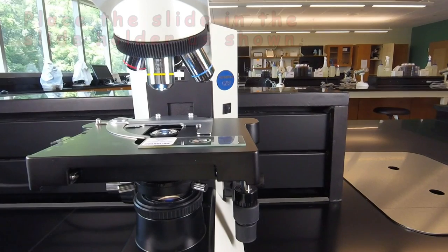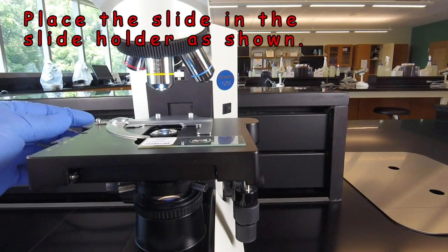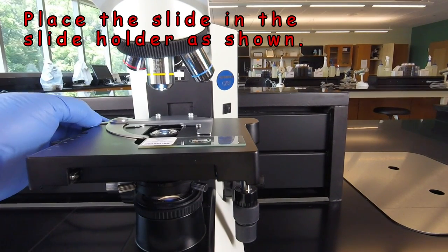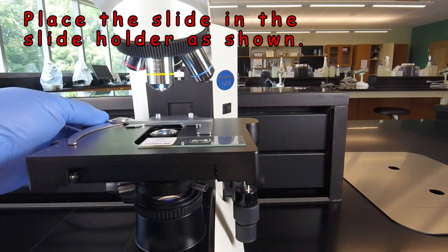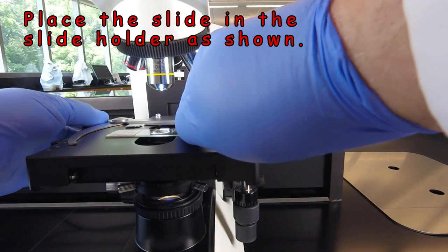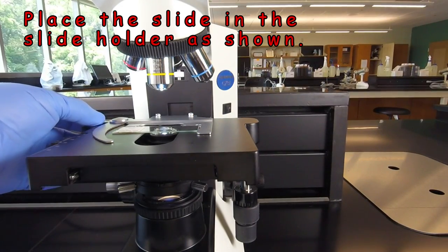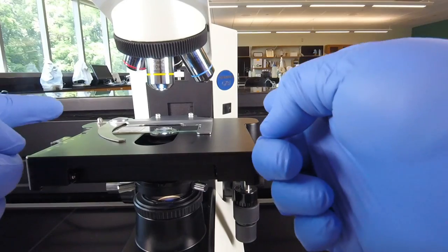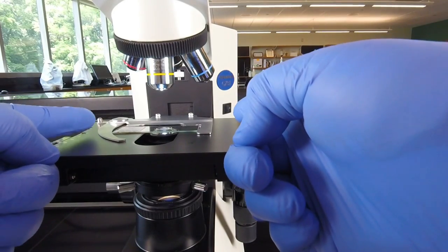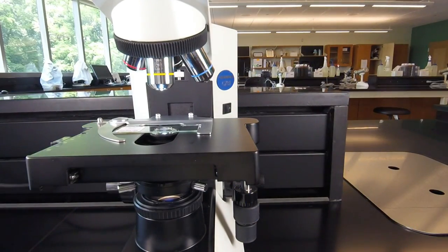Then to place the slide in the slide holder, there's a little knob on the left-hand side here. If you pull that back, that opens up an arm, so you can take the slide and slide it right into this little right angle and then release the arm. And in that way, the slide is being held by the two sides of the slide holder.